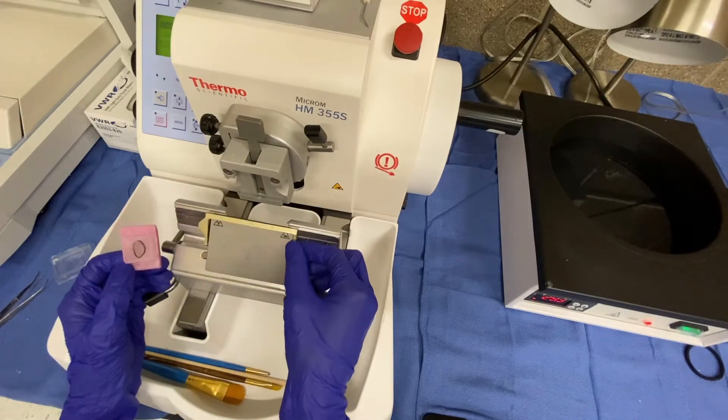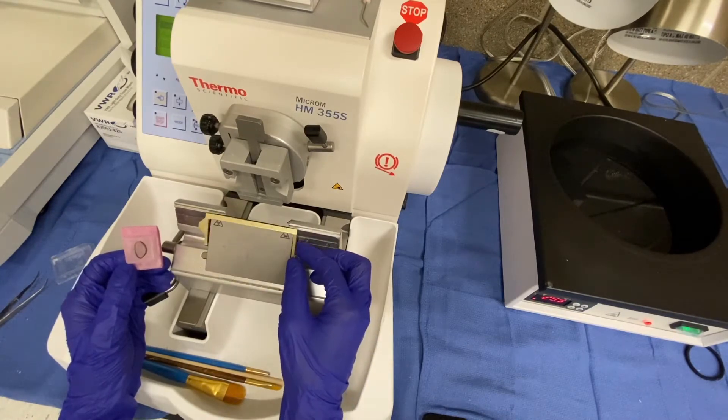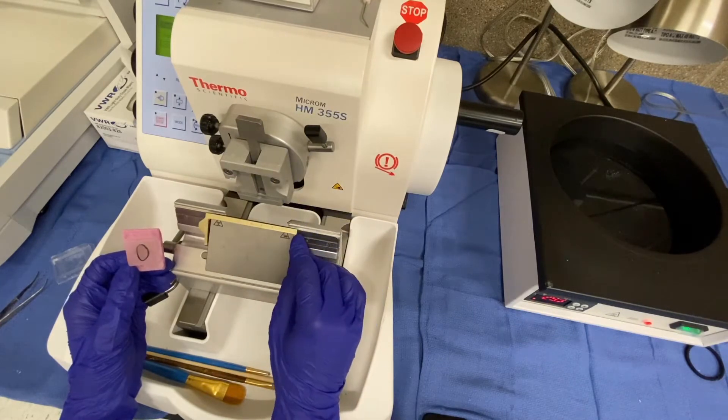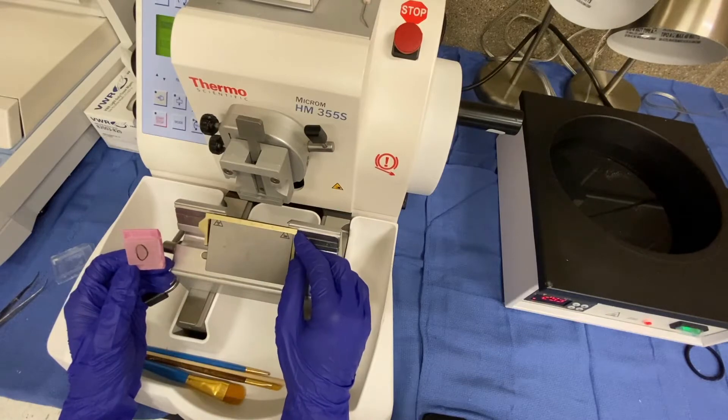Another feature that you need to be mindful of is this blade cover. You want to make sure that anytime you're interacting with any of the features on this machine, the blade cover is covering the blade so that you are not putting yourself at risk of cutting yourself.